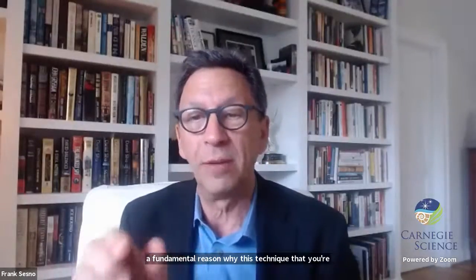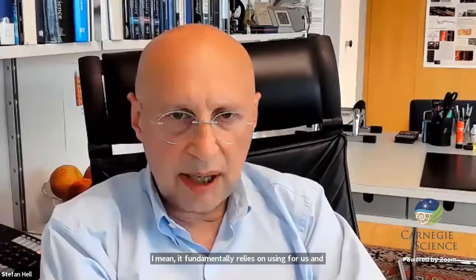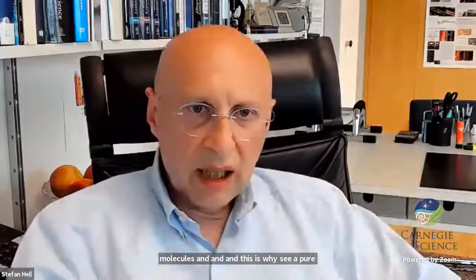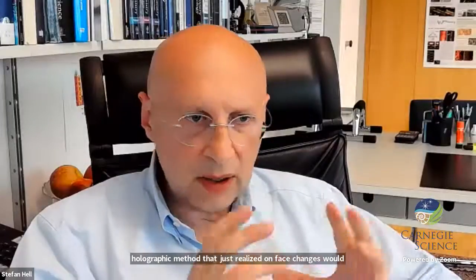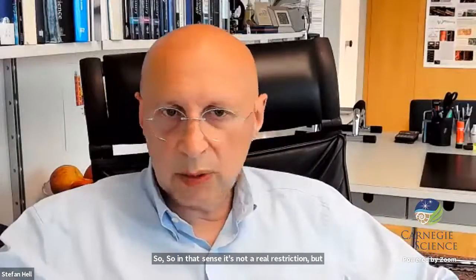Here's another question from an audience member. Is there a fundamental reason why this technique cannot eventually supply holographic imagery of organism cells in vivo? It fundamentally relies on using fluorescent molecules, which is why a pure holographic method that just relies on phase changes wouldn't work. It's a fluorescence method. But thank God, say 80% of the life science applications in optical microscopy are fluorescence methods. So in that sense, it's not a real restriction, but pure holography wouldn't work.